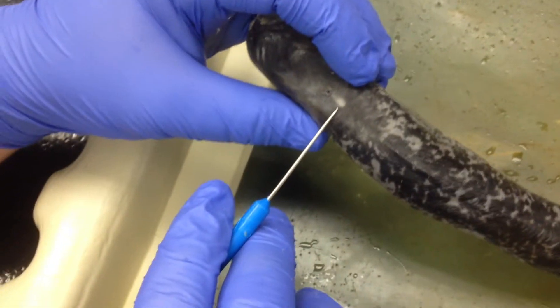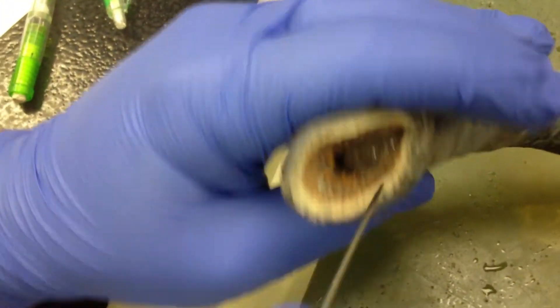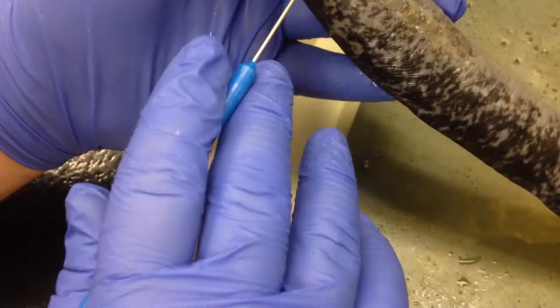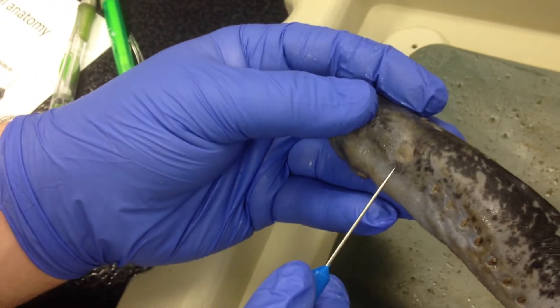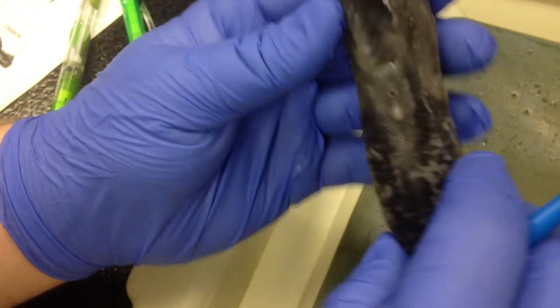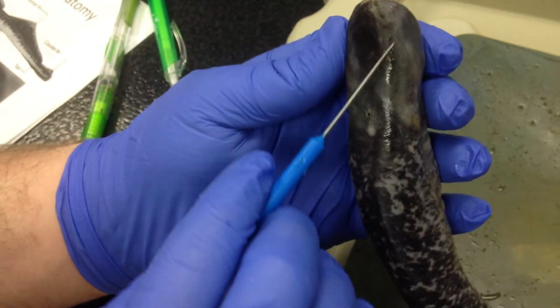The pineal on the bottom. Mouth with teeth. One eye. Second eye. Lateral line, of course — lateral line pores.